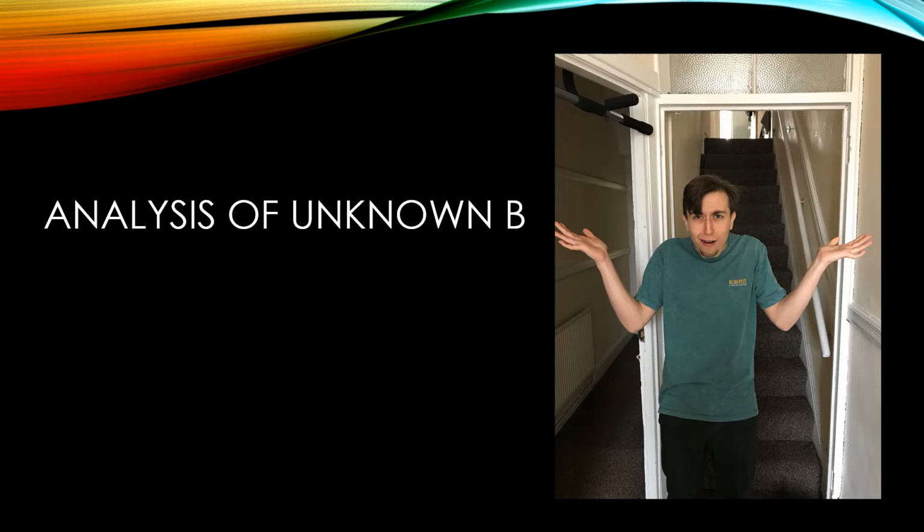So as a pair, we've decided to analyse the unknown solution B. All of the information and tests were provided to us by Simon Bott due to current circumstances that we can't perform those tests ourselves. So let's go ahead and have a look at those cation tests.